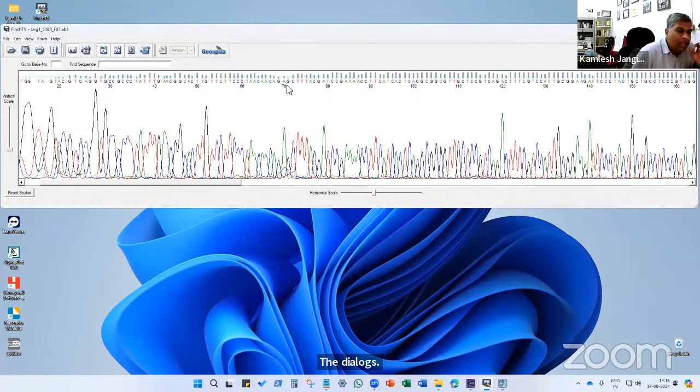The purification technology you use for cleaning up the sequencing reaction will decide how your sequencing output will come. Typically at position 70 and at around 120, if you use an older cleaning method, you will see dye blobs of unused or unclean dyes that are co-extracting within the sequencing reaction, and that's why you will have this bulgy peak here.